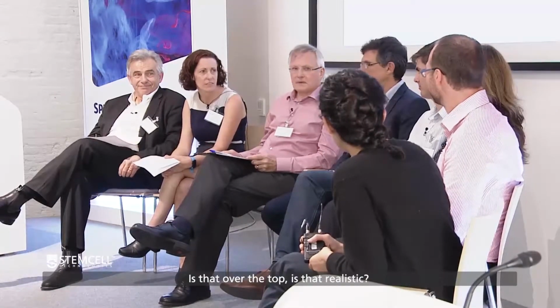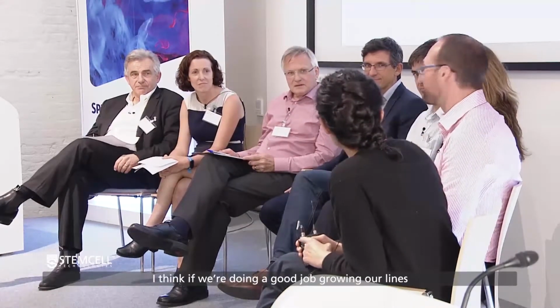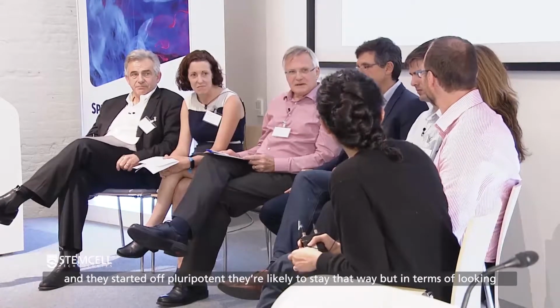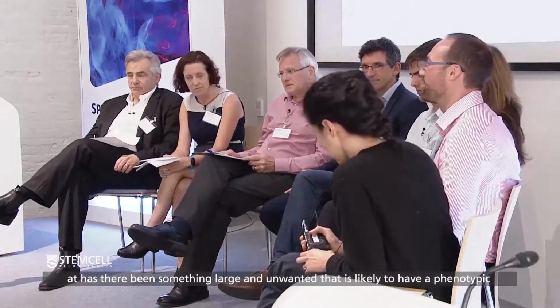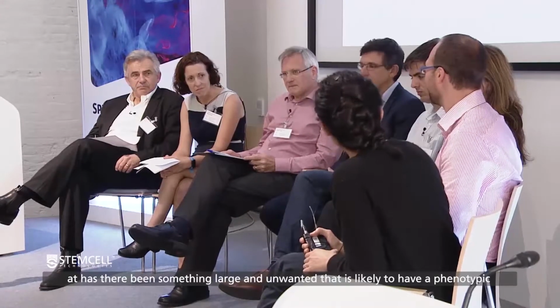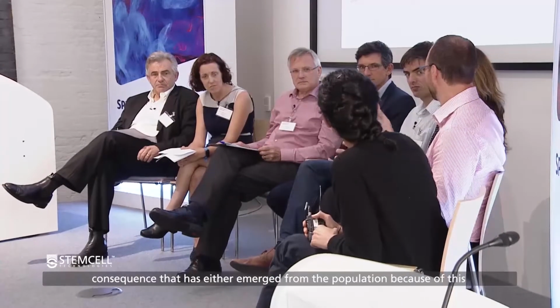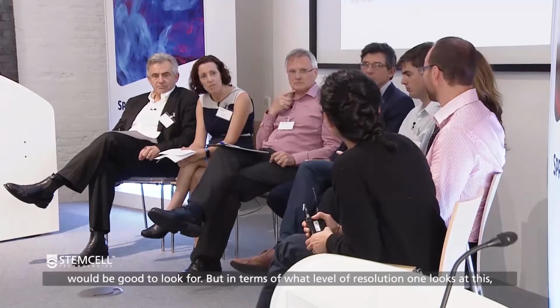Is that realistic? I think genetic stability is... I think if we're doing a good job growing our lines and they started off as pluripotent, I think they're likely to stay that way. But in terms of looking at whether there has been something large and unwanted that is likely to have a phenotypic consequence, that has either emerged from the population because we've gone through this clonal bottleneck or emerged during gene editing, that's something that I think would be good to look for.